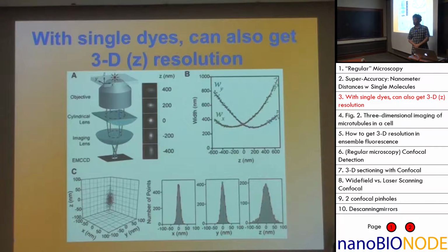So when we did microscope experiments at the very beginning, we talked about DIC and phase contrast. Yes. So for example, in DIC, we use the interferometer. So with an interferometer, could we get a three-dimensional image of the same dye in focus at 0, then get it out of focus, and then in what direction?